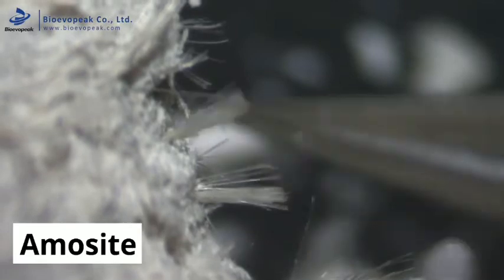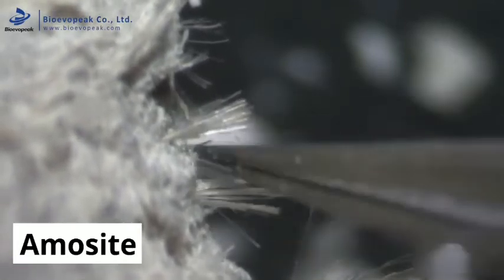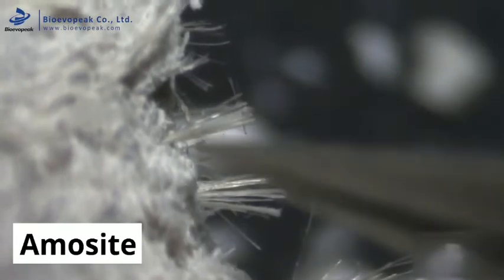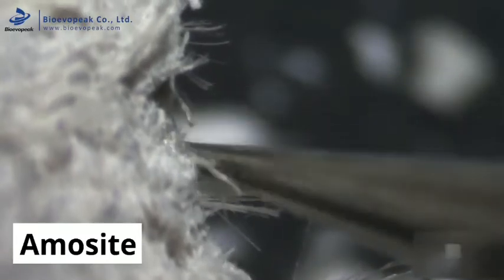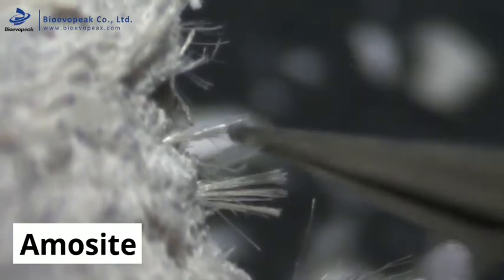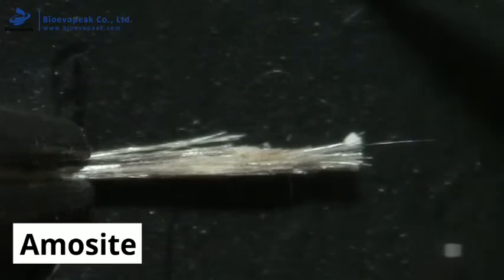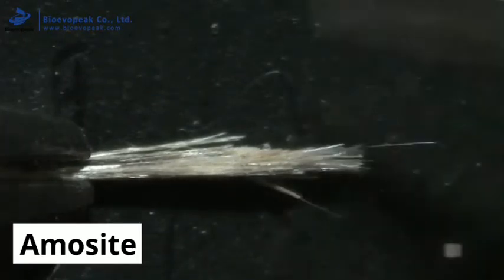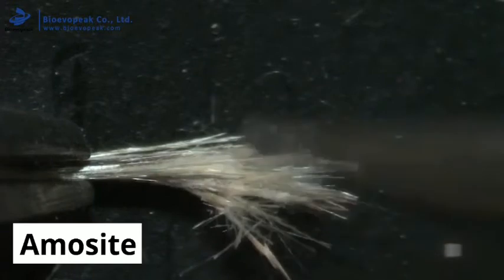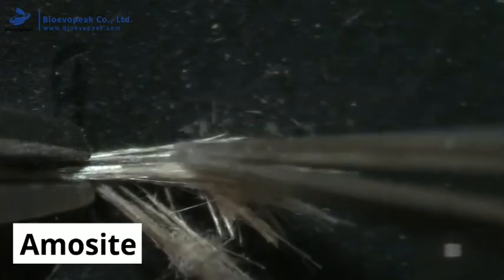Having identified the presence of fibres, the analyst assesses their morphology or shape to ascertain if they could be asbestos, and if so, which type of asbestos it is most likely to be. Amosite presents as short, straight, grey to brown coloured fibres that have a paintbrush end effect or form in small bundles.